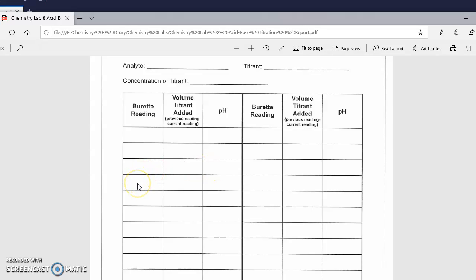Then we're going to this one, and this is 25.0 milliliters. So that means we've added 20 milliliters here, exactly the number of milliliters that we had initially. So the pH here is going to be a pH of 7.00. We're going to add just a little bit more now. So this is going to be 24.8. Okay, so you can see how the values are dropping down here as we add more and more of the material. So the total volume added is now 20.2. This is going to raise the pH here to 11.3.